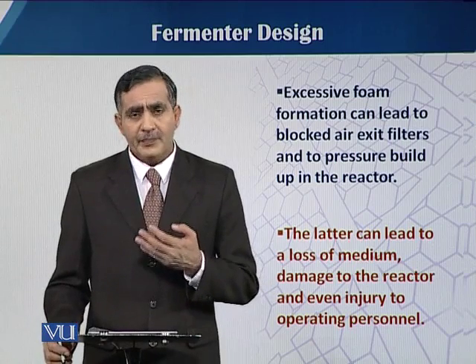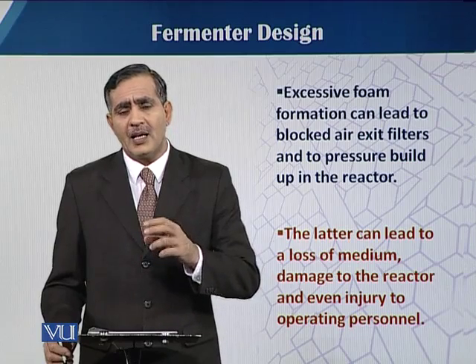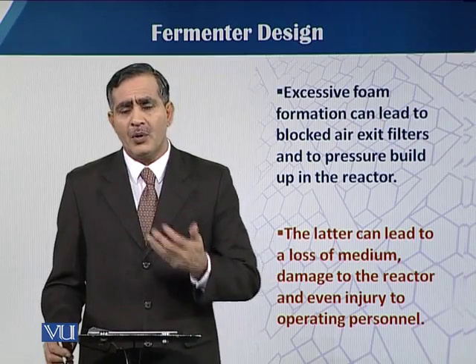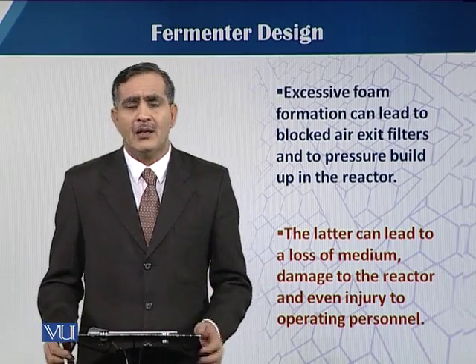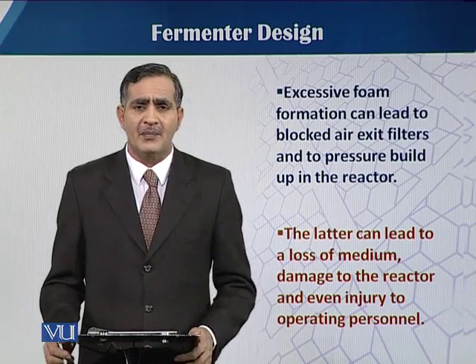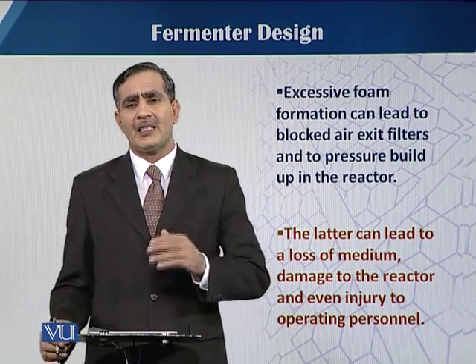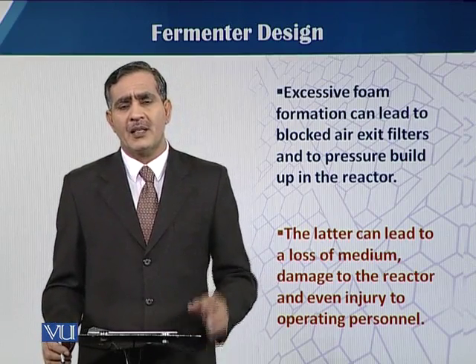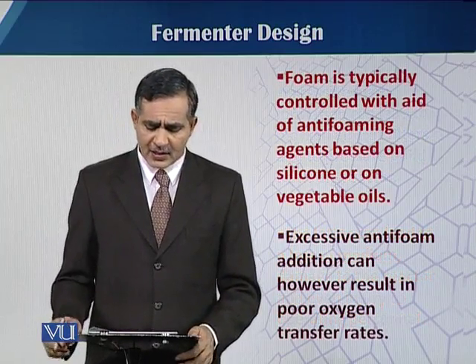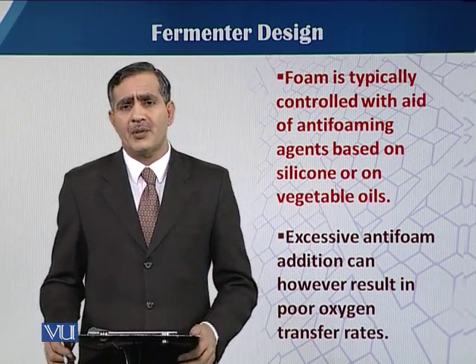When there is no blockage, or it is removed, and we have no direct manual intervention, then there is a gradual loss of the medium. In the absence of operating personnel, there is a risk. So to avoid this risk, the foam has to be controlled.